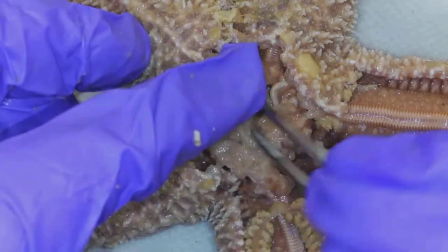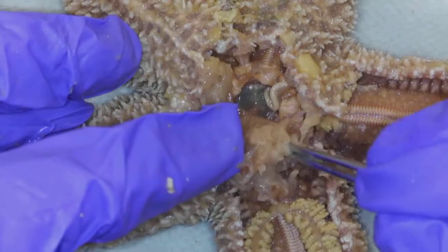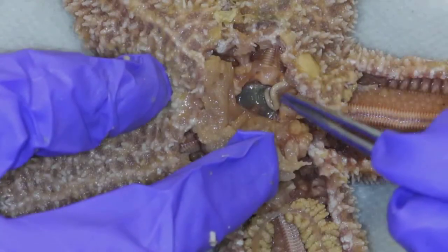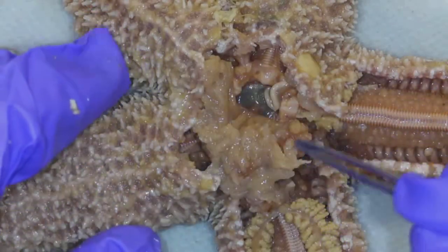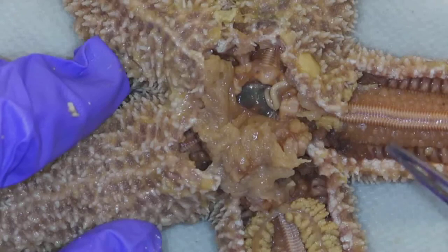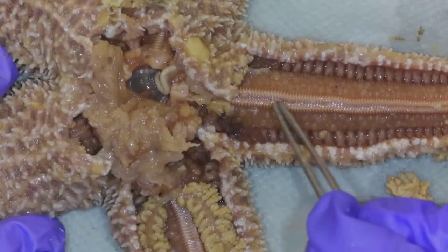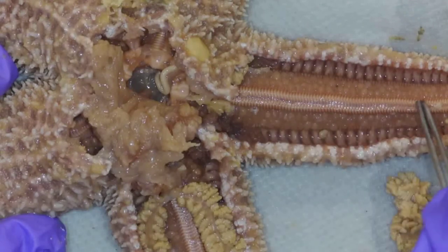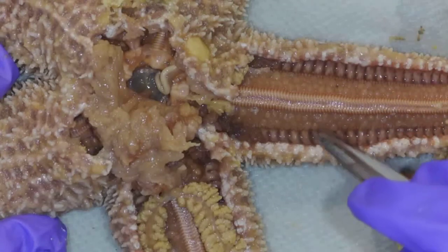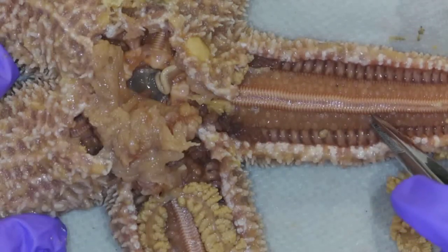I kind of have to mess up the stomach to really see it. So it's going to go madriporite, stone canal, ring canal — I really can't see the ring canal. And then it goes from ring canal to the radial canal, which I can't see either. The radial canal is underneath this ridge, which is called the ambulacral ridge. But then water is going to travel down each radial canal of each arm, and then it goes into these pink squishy structures.